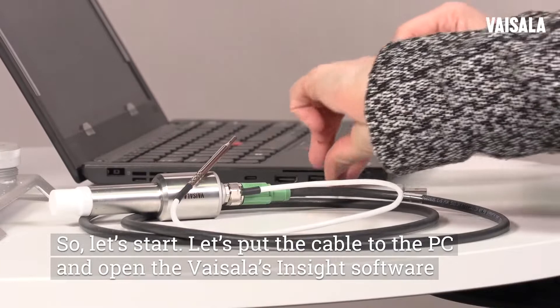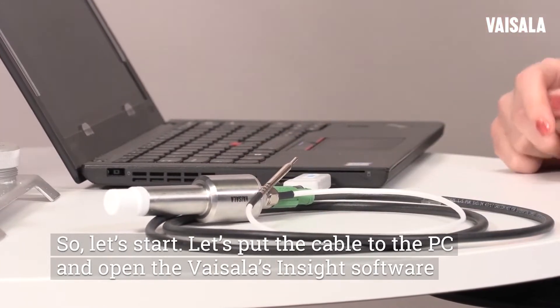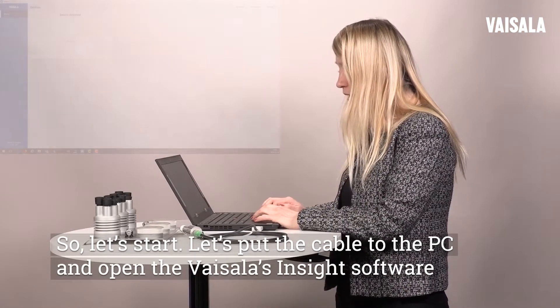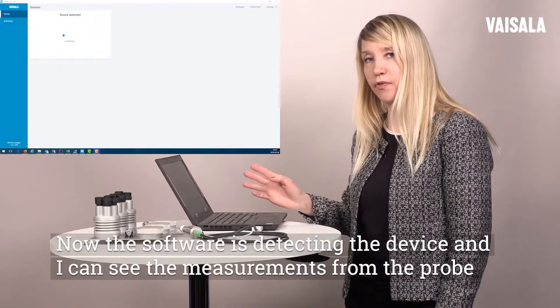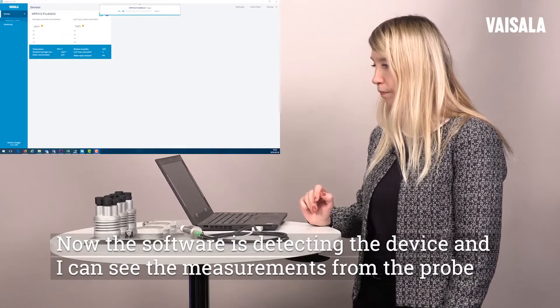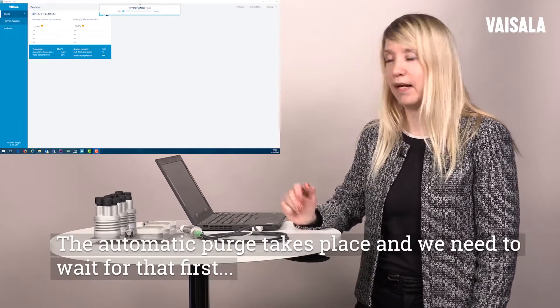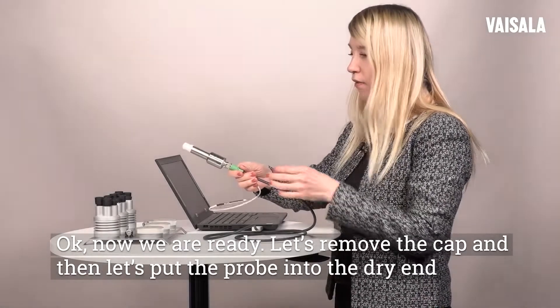Let's put the cable to the PC and open the Vaisala Insight software. Now the software is detecting the device and I can see the measurements from the probe. The automatic purge takes place and we need to wait for that first. Okay, now we are ready.